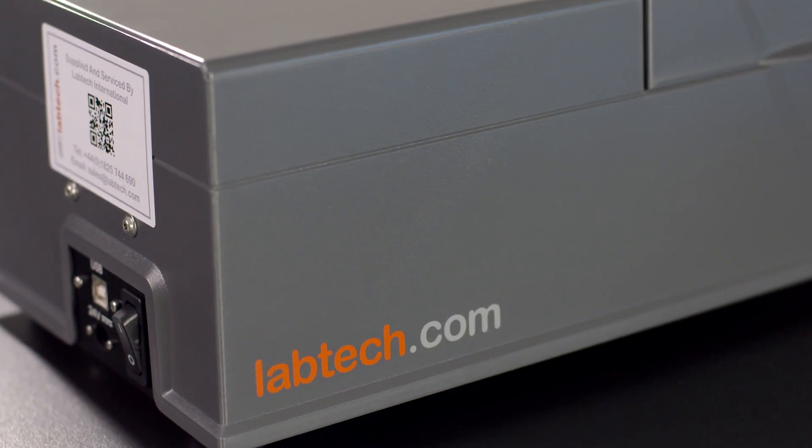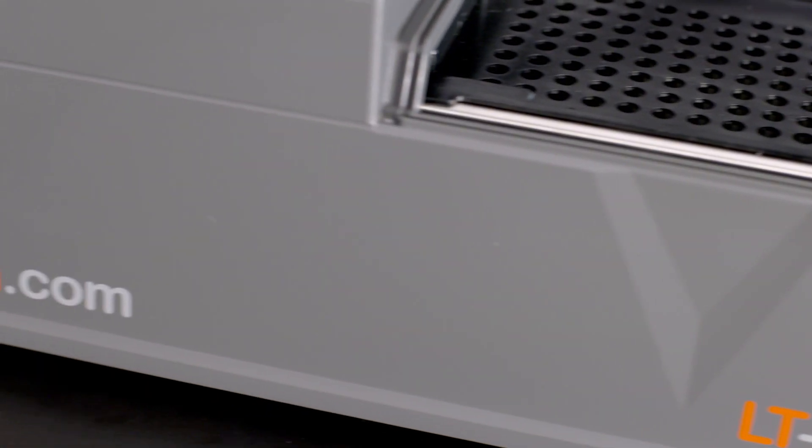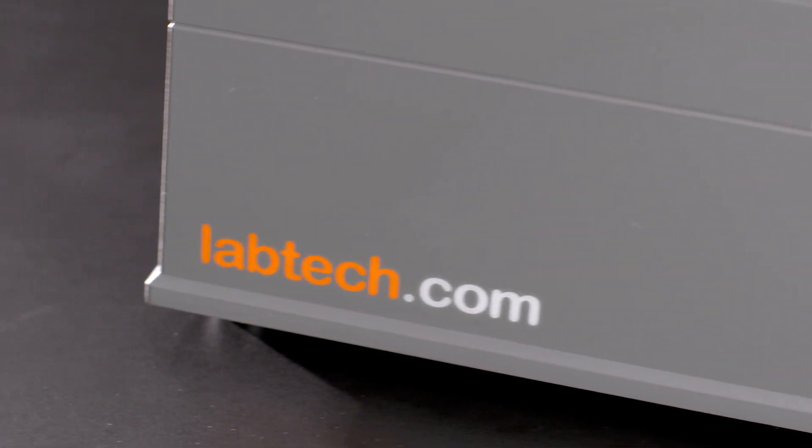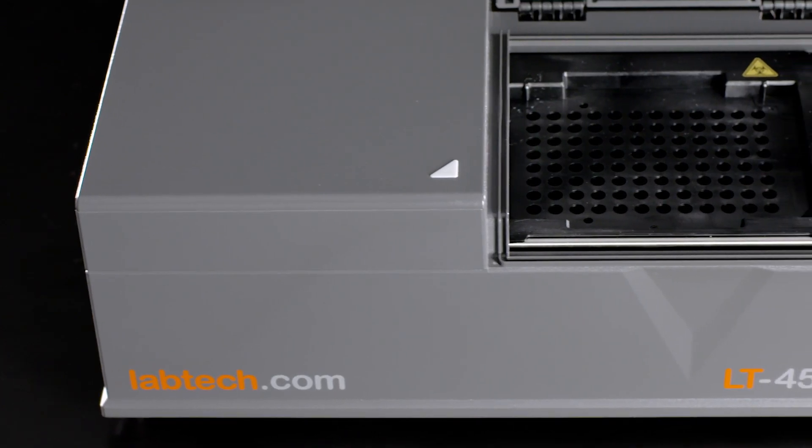Using more than 20 years of experience with microplate technology, Labtech International have produced the innovative and surprisingly affordable LT4500 absorbance reader and software package.